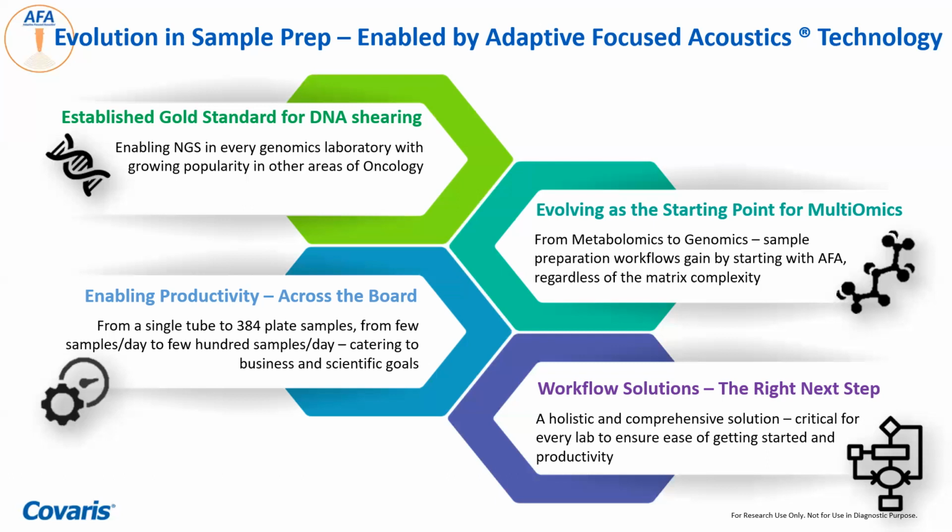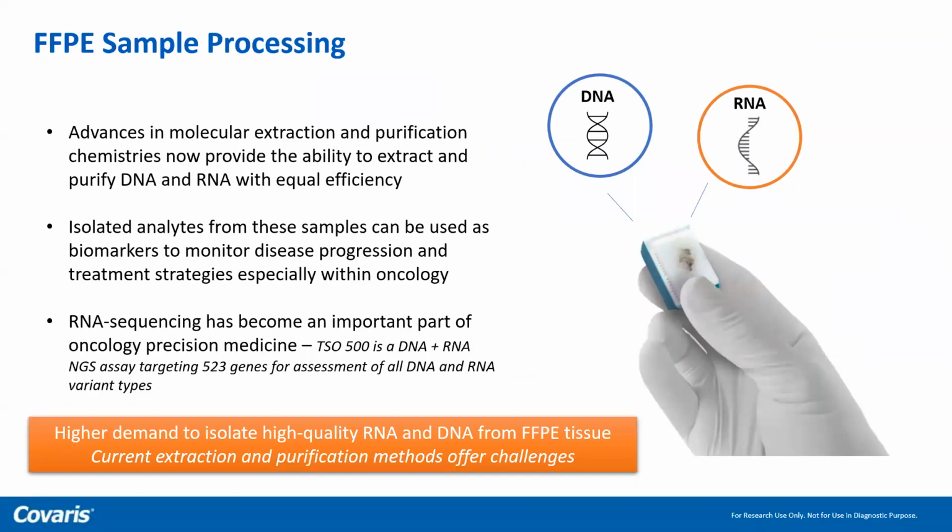And what would that complex matrix be, other than the biological matrix? That is called FFPE, formalin fixed paraffin embedded. Now, you may not be using it, but are you all aware of what FFPE is? Right? So you have the tissue in the wax block. It is amazing that such a technology exists, that someone in upstate New York has a tumor that's been operated on and a slice of that gets into the wax block, and it can go to Los Angeles or a different country without losing its integrity.